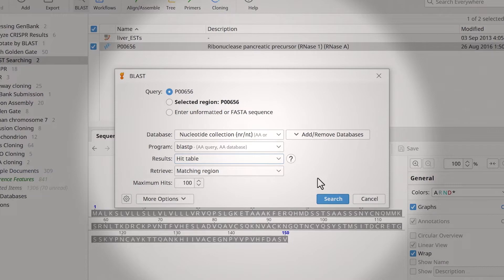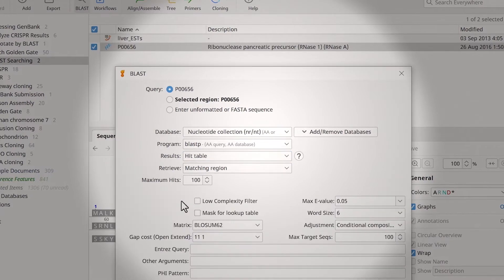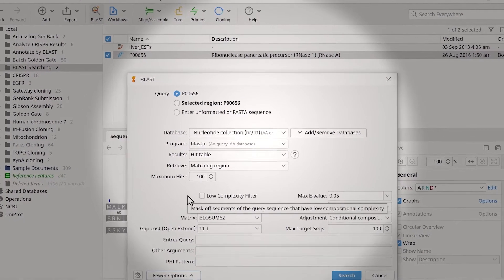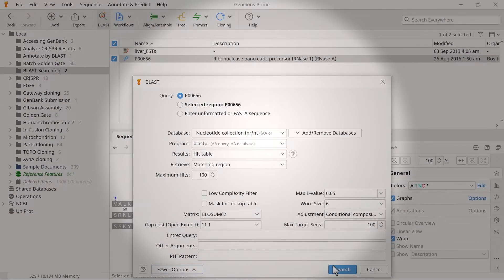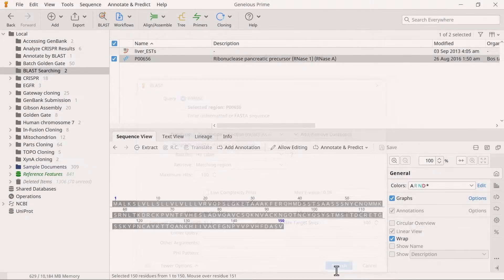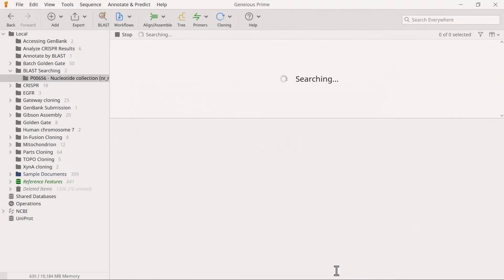To adjust the search settings further, expand the More Options button to reveal the advanced settings. Finally, to run the BLAST, select Search.